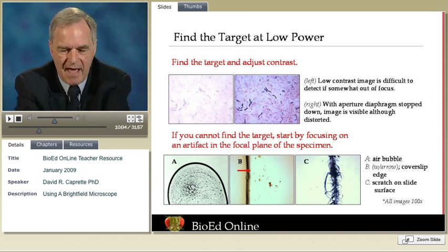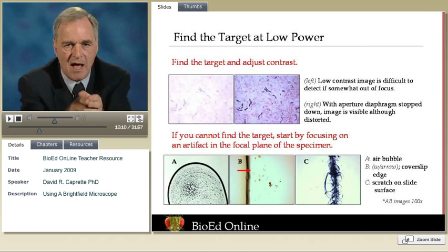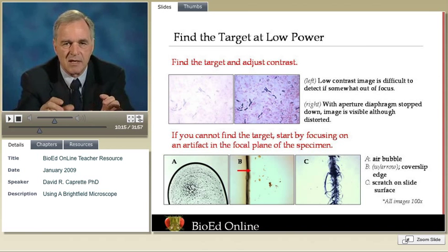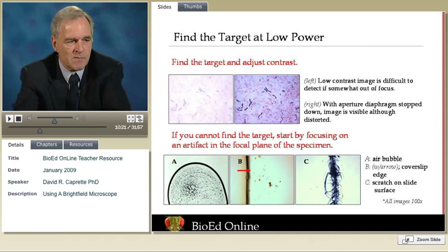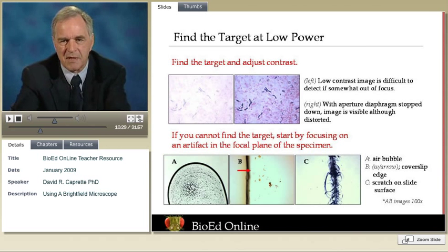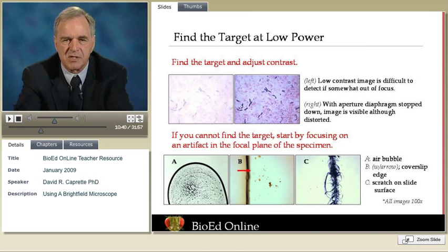Another way is to go to the edge of a cover slip and focus on the edge at low power. You'll see a nice, crisp line that will be at the top or bottom of the cover slip. Try to adjust the stage so you're looking at the bottom edge of the cover slip — that will be the level of your specimen. Another trick used especially in microbiology is to take a diamond marking pen and put a scratch on the slide. With a smear, you can even put a little mark through the smear using an applicator stick or pen to give yourself something to target.